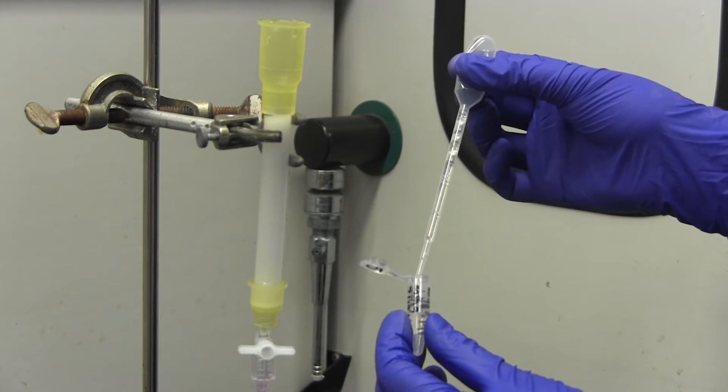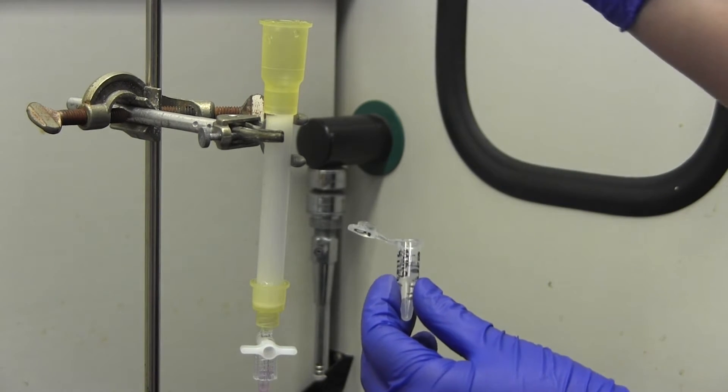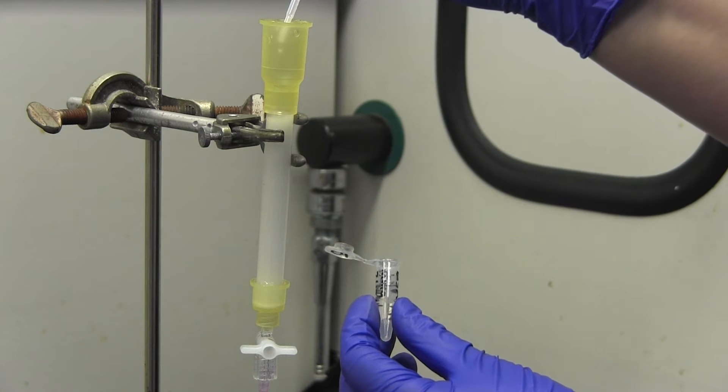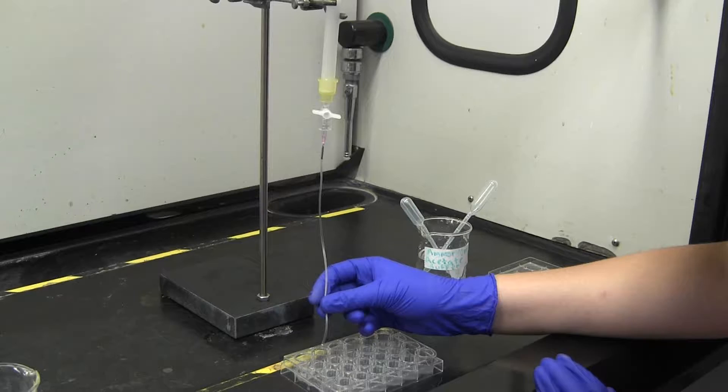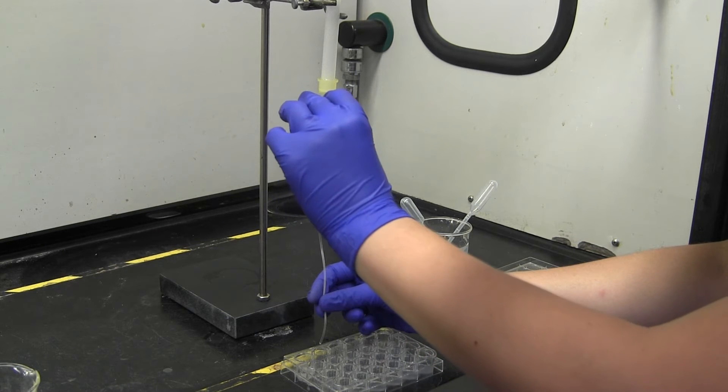Before the gel runs dry, close the stopcock and add a half milliliter of your unknown. Now you will begin to collect fractions. Make sure you catch all of the drops and keep your fractions evenly sized.